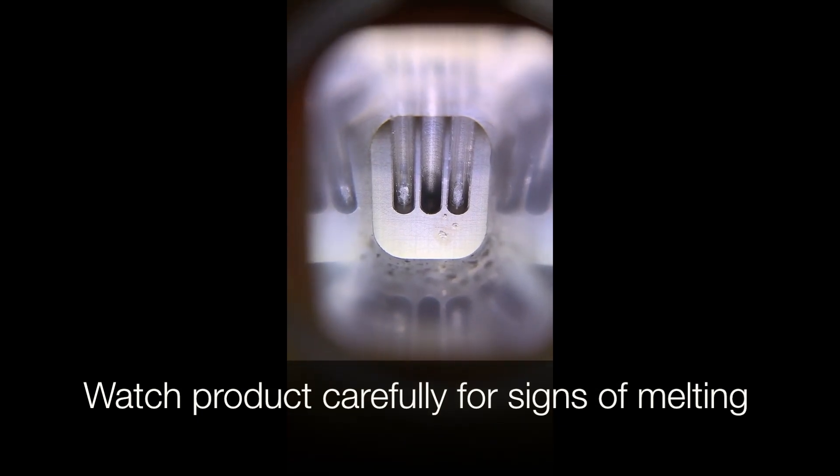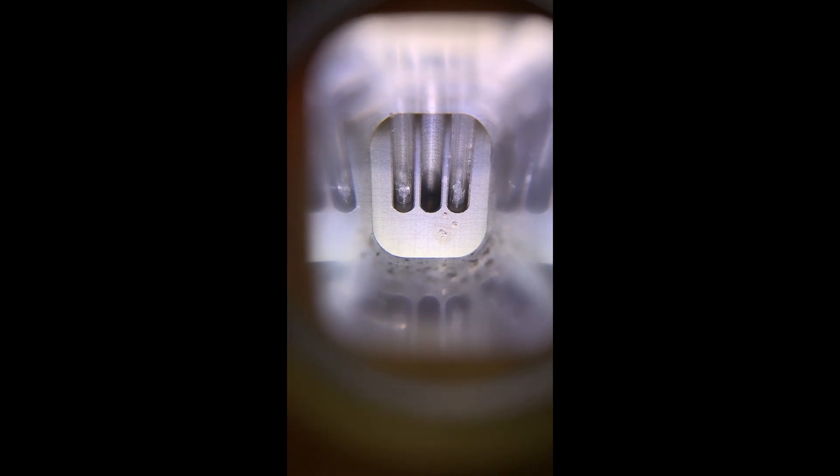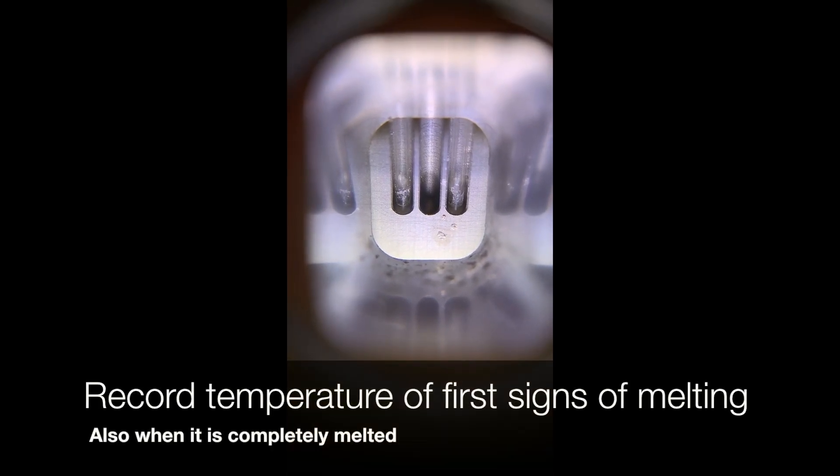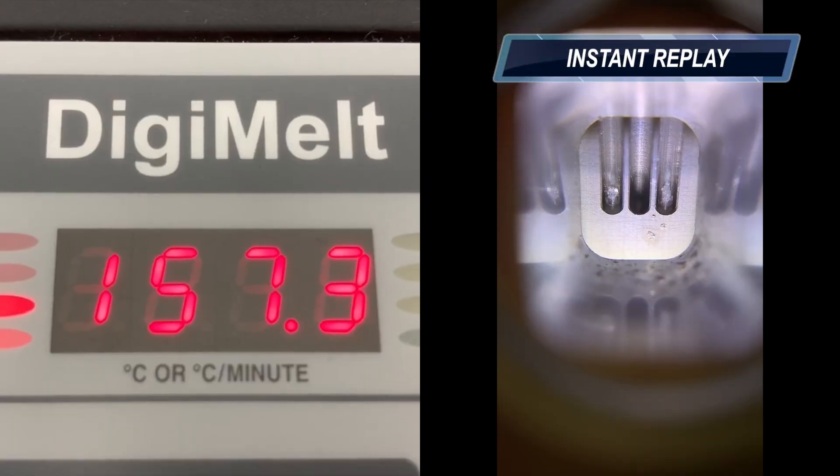Watch your sample carefully for signs of melting. Signs of melting include bubbling and collapsing in on itself. When you see the first signs of melting, record the temperature because you don't want to forget it.